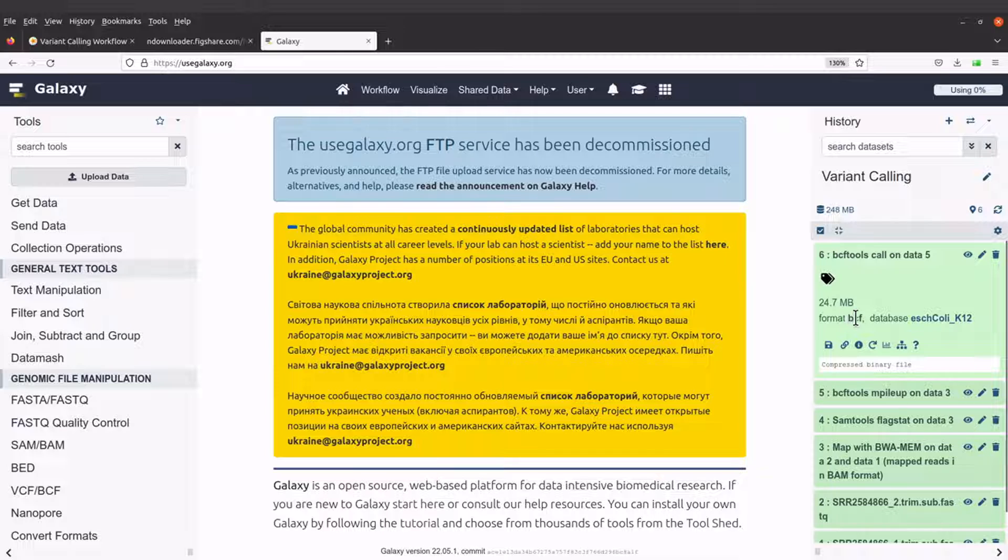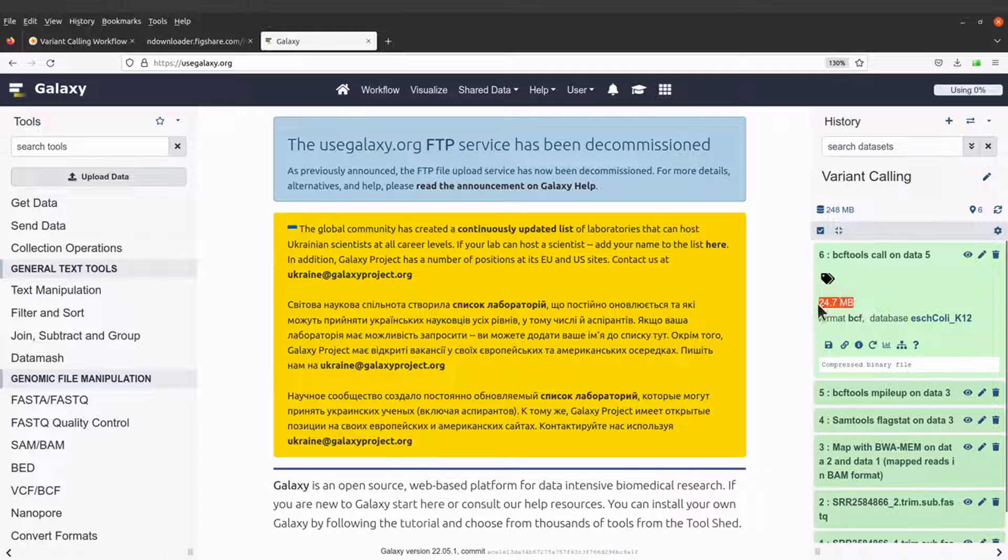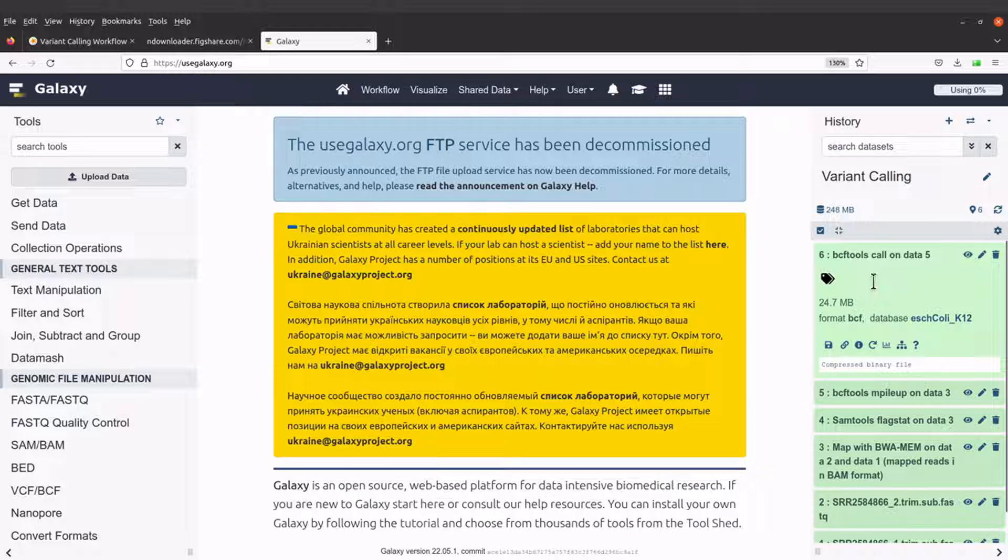If you take a look at the format, it's BCF. That means that the file is in the BCF format. The size is 24.7 MB. It's very small.